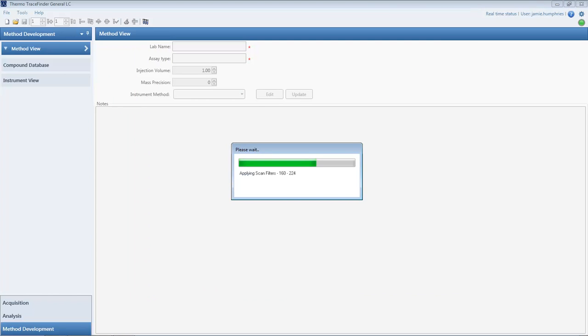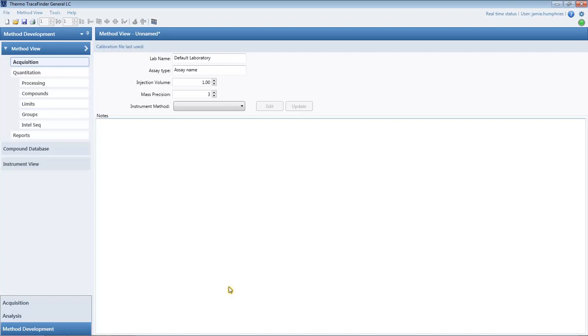Back in the method development workspace, we can check all of the master method parameters. This can include the instrument method, which can be selected from the drop-down list.